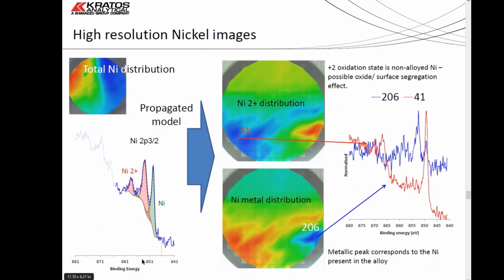The nice thing is you can then get... So those were just survey scans, 60 seconds over about 200 locations. So you can quickly work out the kind of time periods for these. So you've got a few hours. You can then go and do high res spectra for the different elements.